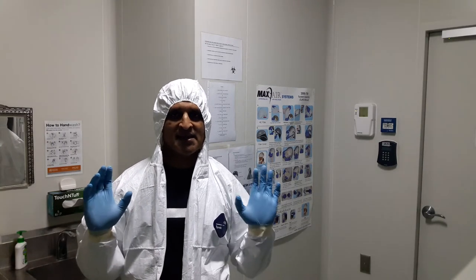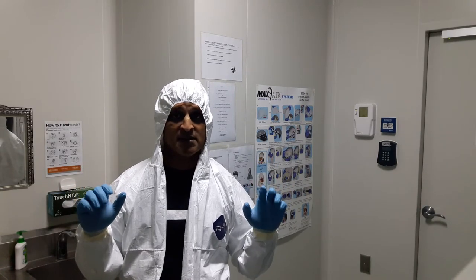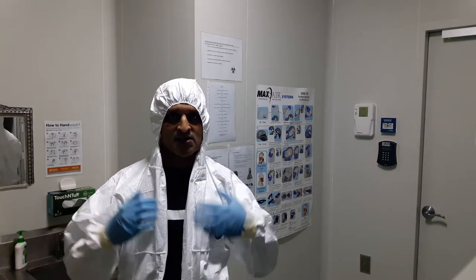Hello and welcome to this MOOC — massive open online course — on bio risk management. Today I have made this video especially for the participants of this particular MOOC, so I am wearing what is known as personal protective equipment.